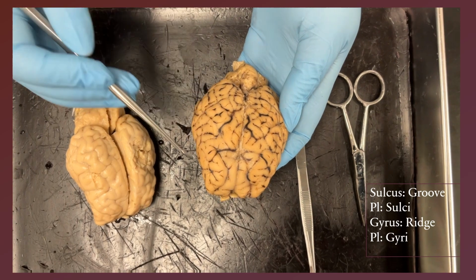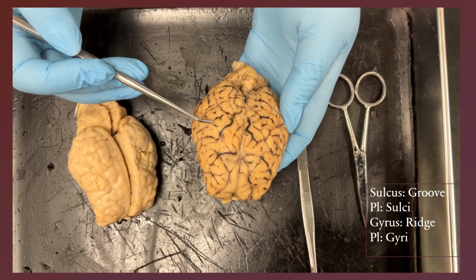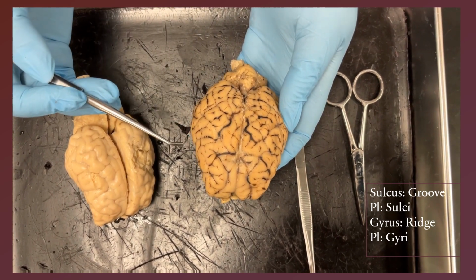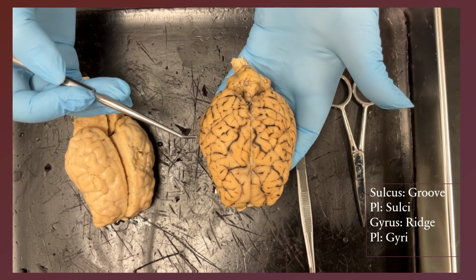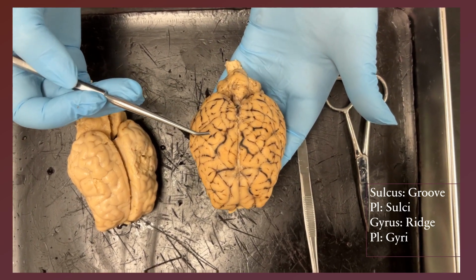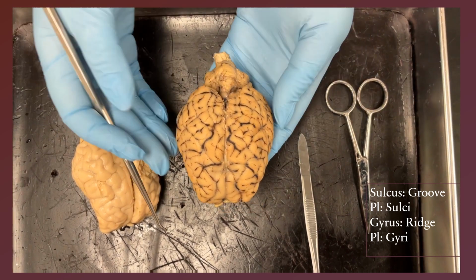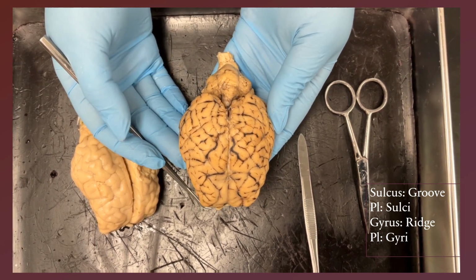These separate the brain into different regions, and by brain mapping, we could get to know which areas are responsible for what function. And remember, the sheep brain is much smaller and much less complicated than the human brain. But of course there are similarities because these two are mammalian systems. That's why we use this specimen in the lab to show you some major areas of the brain.